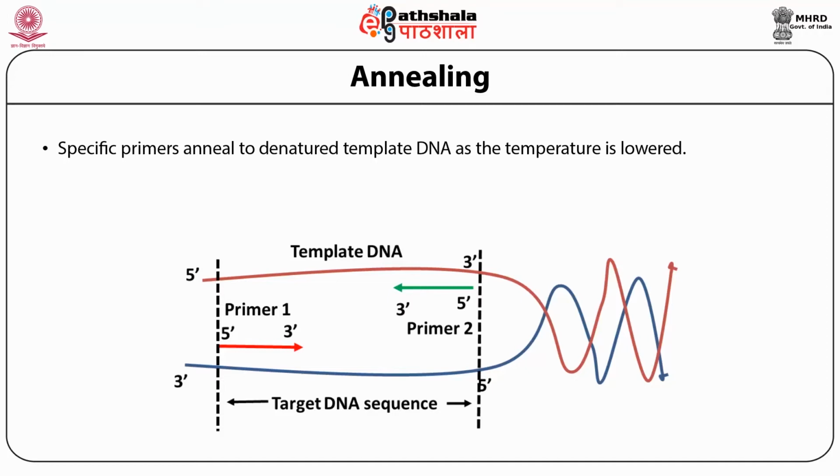In other words, primers can only bind to a perfectly complementary sequence of the template. If the temperature is selected very low, primers would bind non-specifically. When the annealing temperature is kept too high, primers will fail to anneal as hydrogen bonds cannot form.